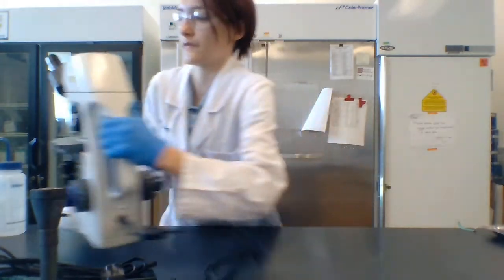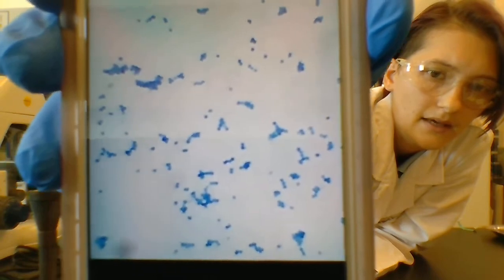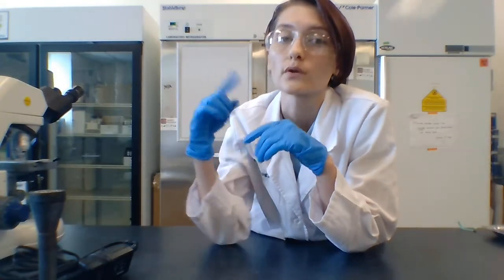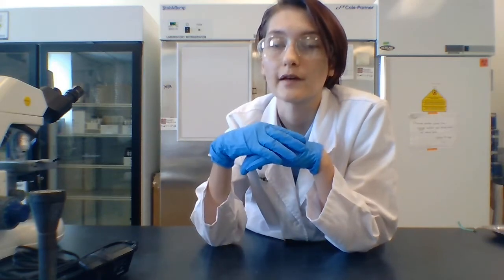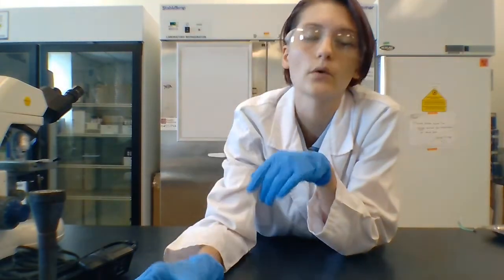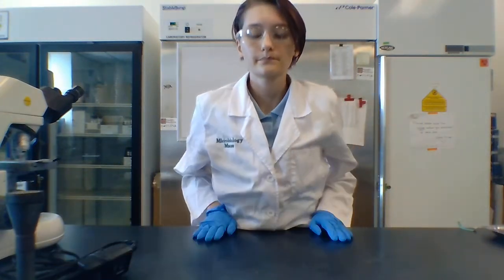So I have a picture of that for what these germs look like. If you can tell, they kind of look like little dots, right? Those are little circles, and the way that they're forming together is in clusters. You could also have ovals or spirals, and you could have them cluster like this, where they're just kind of jumbly, or you could have them in lines. And that will tell you a little bit about the germ that you're looking at.